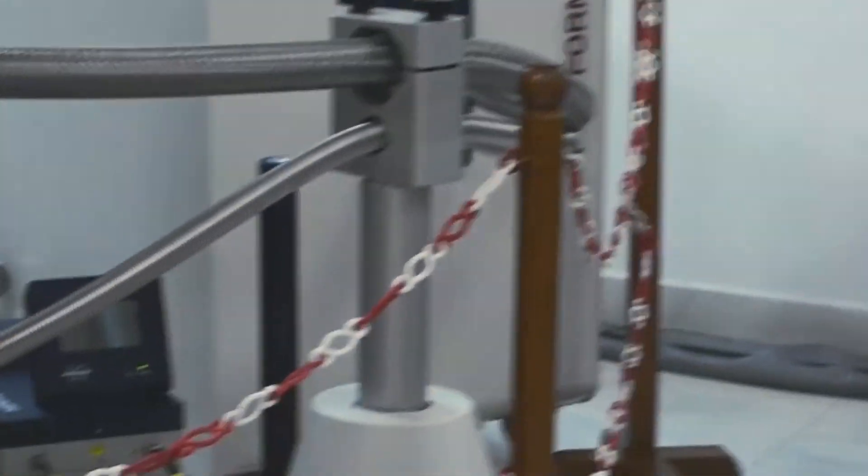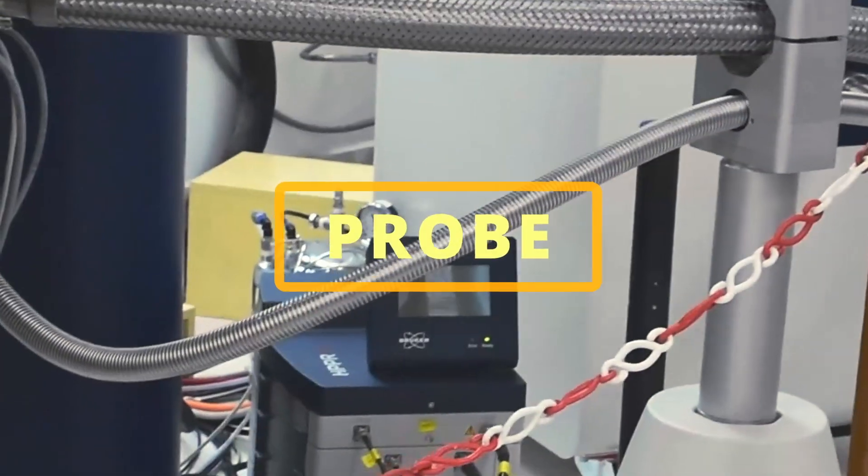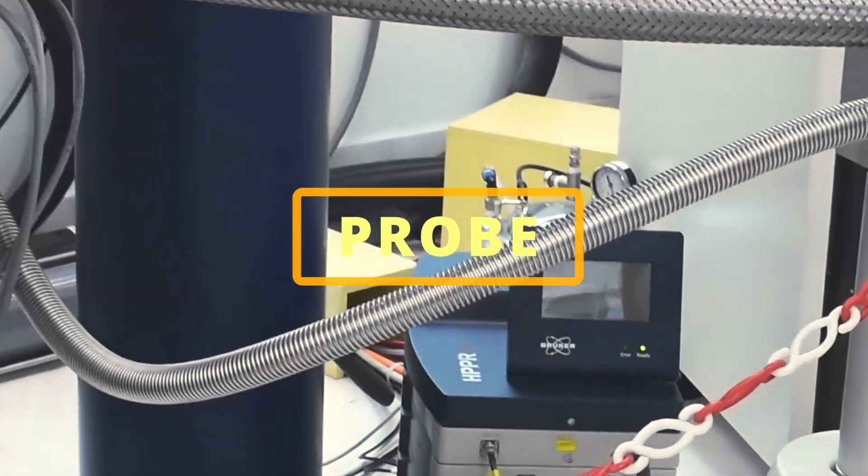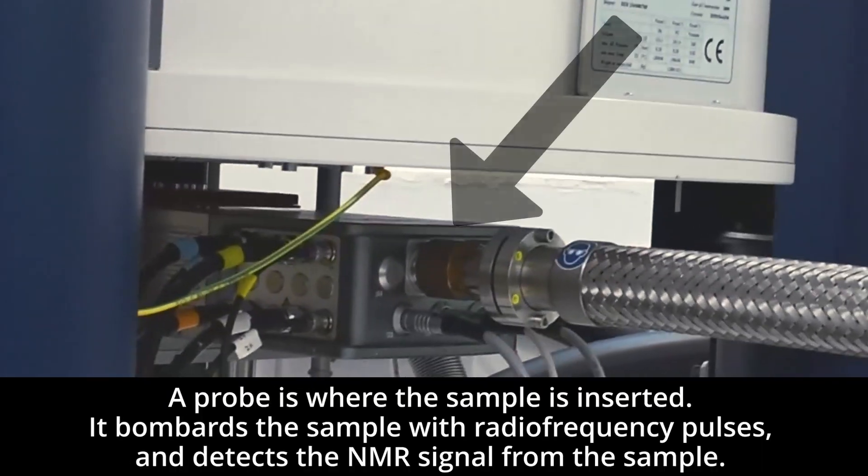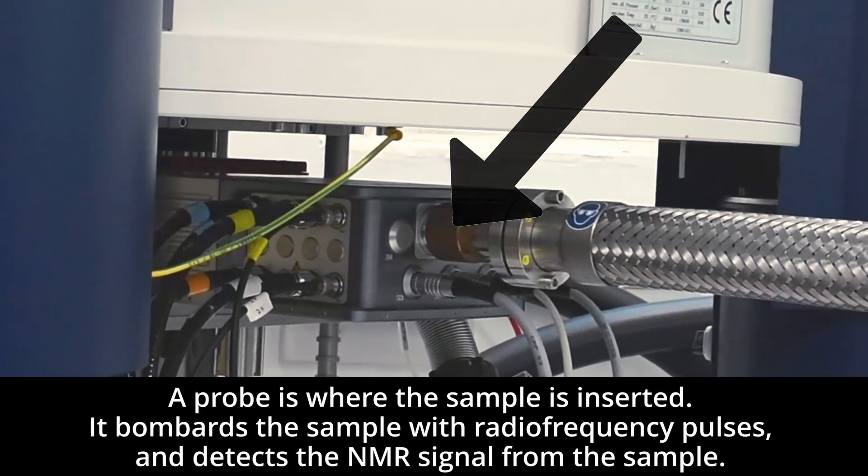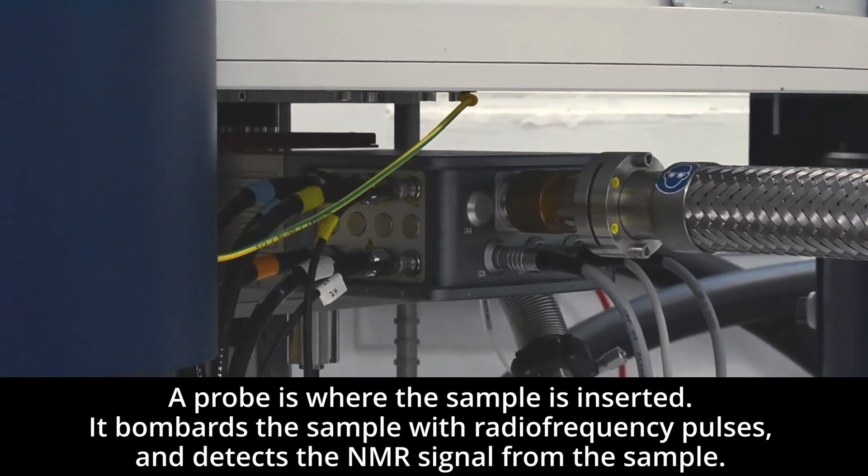Here at this stage, you can see from below in the same barrel, we have put up something called as a probe. This probe is also very unique for this setup. We call it as a cryogenically cooled probe. The probe also has electronics that is kept at 17 Kelvin.